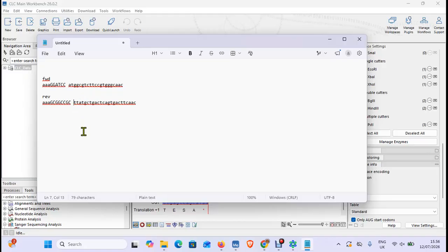All things being equal, if nothing else dreadful happens, this will generate you a very, very nice PCR product, which you can then go on to gel extract and digest, ligate and clone. But that's a story for another time. This rather high velocity tour of just basic primer design is for a plasmid, but now we can go back and rework it, because after all, like the course of true love, science doesn't run smooth either.